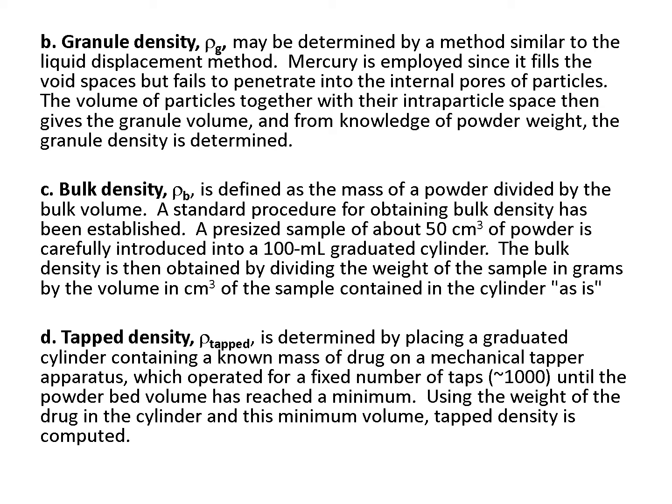And also tap density is determined by tapping. We can tap it usually several times to get a constant value. We can use the same cylinder containing the powder.